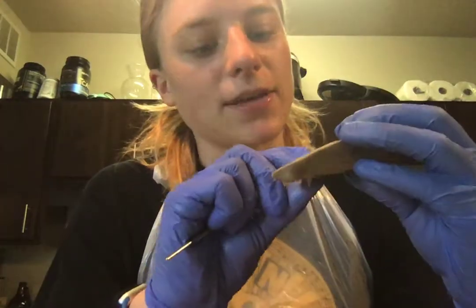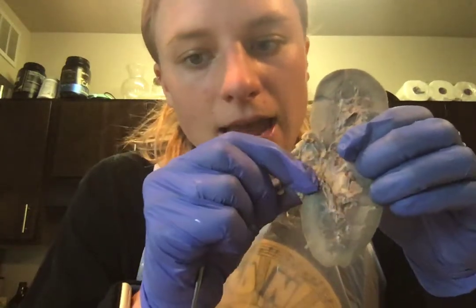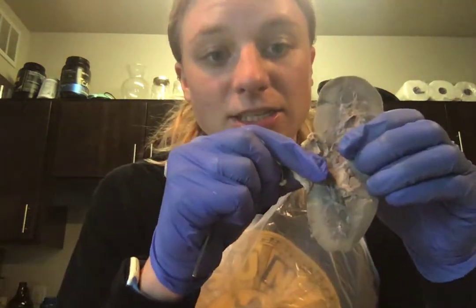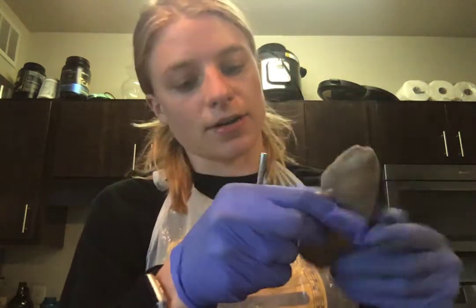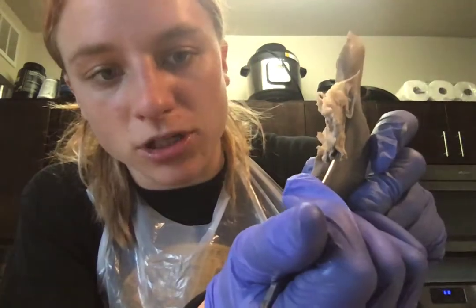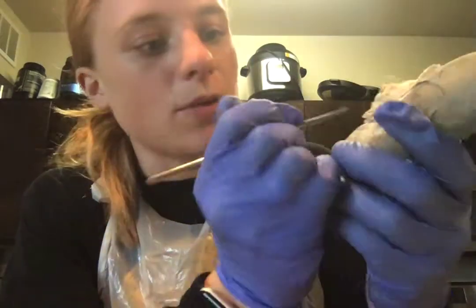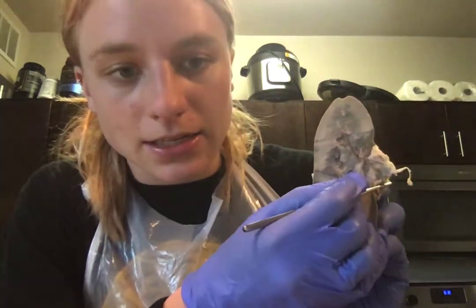So the renal pelvis is going to be this portion right here. And the renal pelvis is connected to the ureter. So if we can find our ureter, here it is. So it's this opening right here. This is the superior portion of the ureter. But this is where the renal pelvis is going to drain into the ureter.